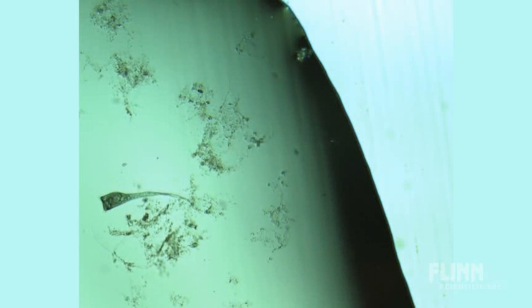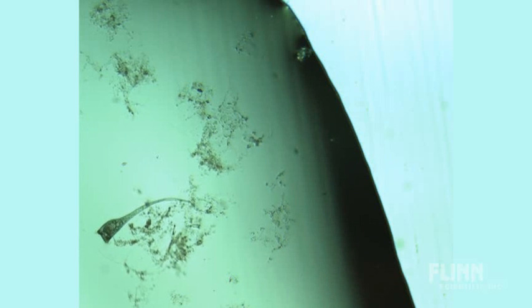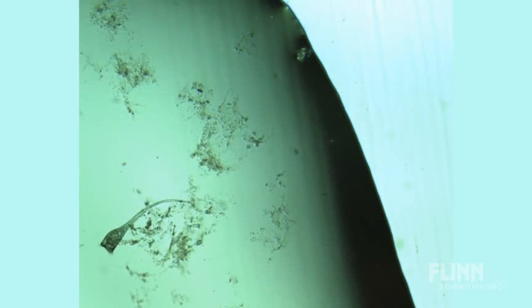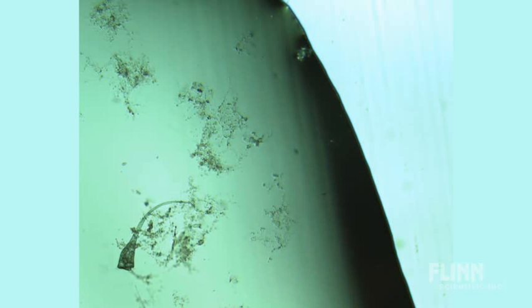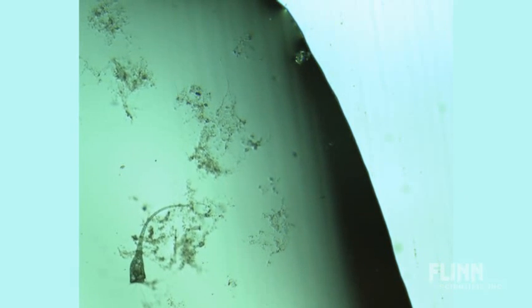Stentors are one of the most fascinating organisms to watch feed. So often, laboratory manuals will suggest that you starve them for a small period of time, and then add a couple drops of a diluted yeast solution or bacterial solution so that they will eat. Be careful — it's easy to starve the stentor to death, in which case your lab will not be successful. By doing these few tips and looking for your stentor where they're located in the culture dish, you'll save yourselves and your students a lot of frustration.